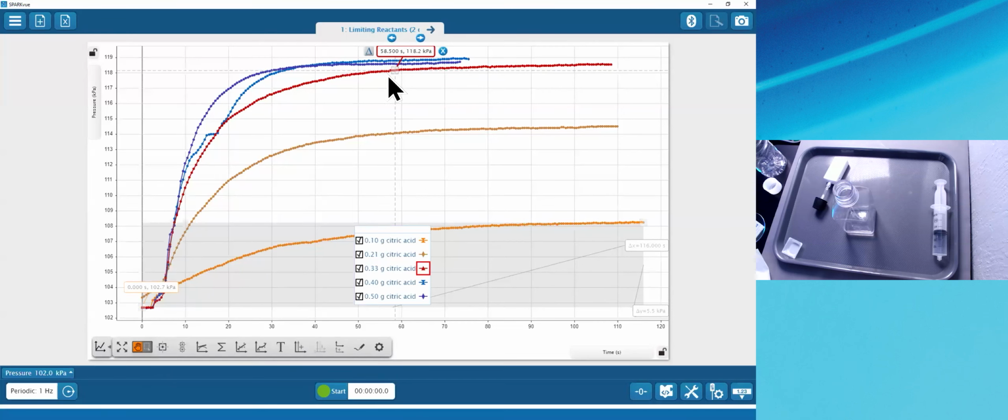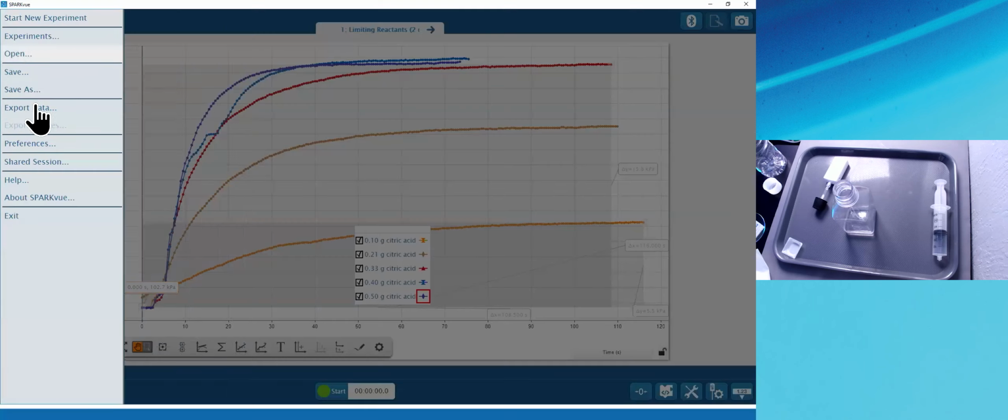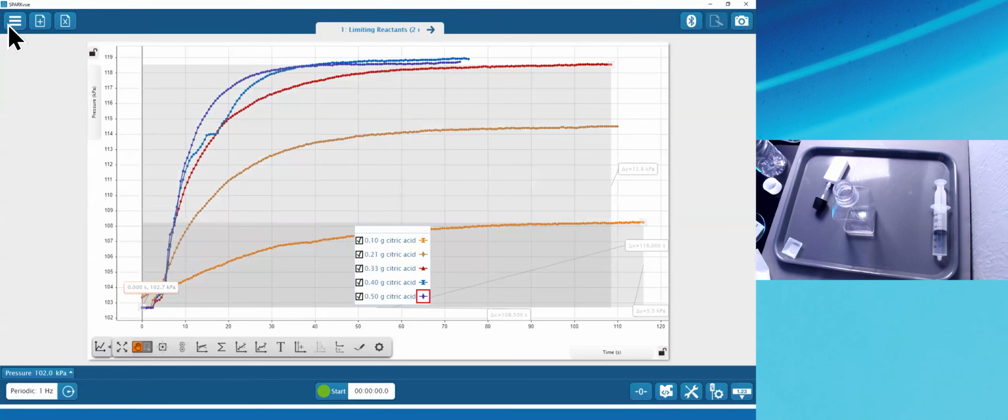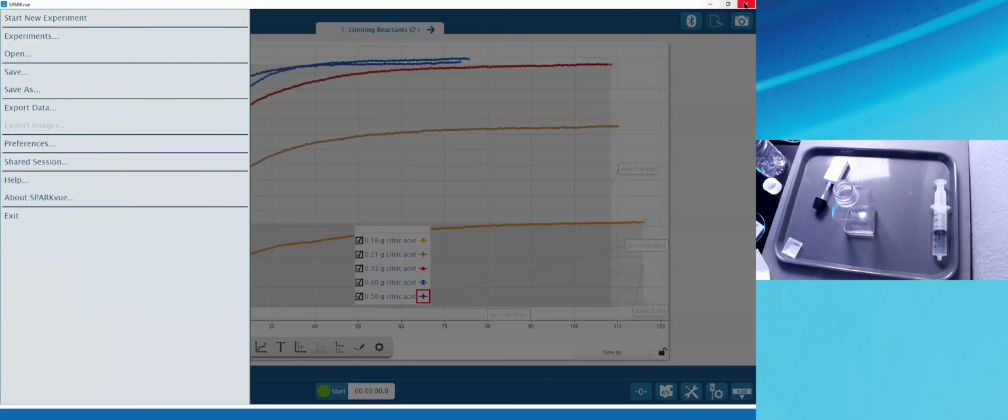So let me turn on that delta tool. My initial, there it is. Yeah, it came back. I just tried it again. Here's my 15.8. And my 5, it's in shadow, but that's the 5.5 from the original run there. But yeah, it'll save multiples. You just have to make sure that you're switching runs. And then when you save it, whatever you've done previously, you should be able to close and reopen, and all of that analysis will be there.